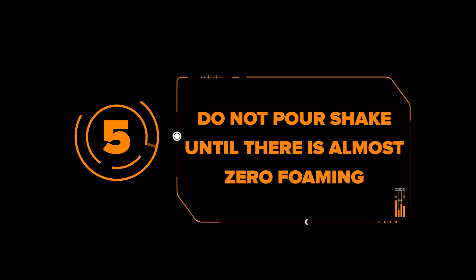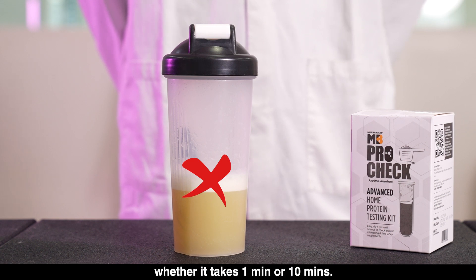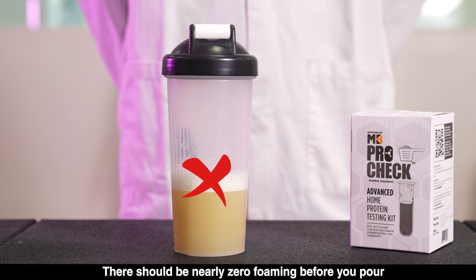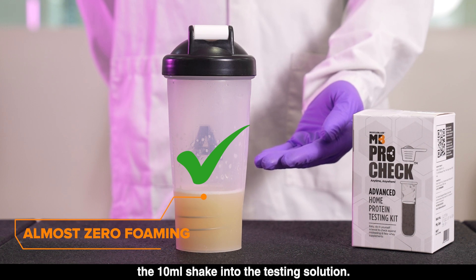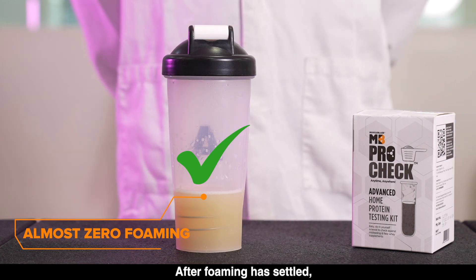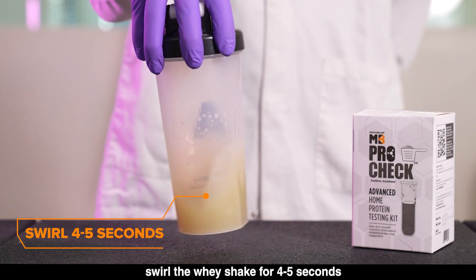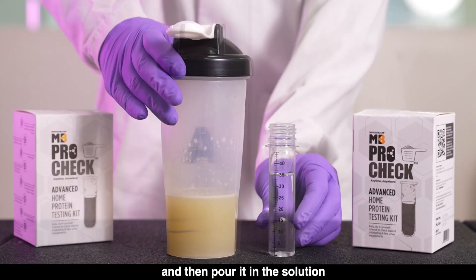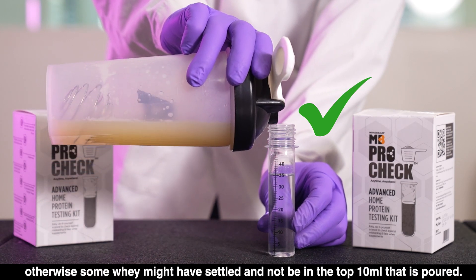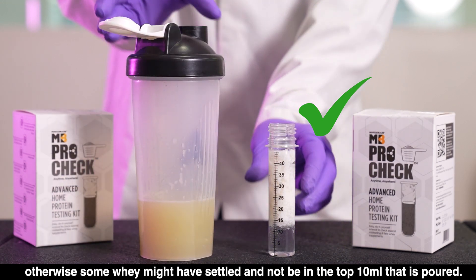Mistake 5: Do not pour the shake until there is almost zero foaming. Wait patiently for the foaming to settle completely, whether it takes 1 minute or 10 minutes. There should be nearly zero foaming before you pour the 10 ml shake into the testing solution. After foaming has settled, swirl the whey shake for 4 to 5 seconds and then pour it into the solution. Otherwise, some whey might have settled and not be present in the top 10 ml that is poured.